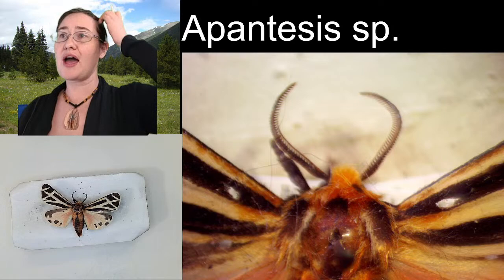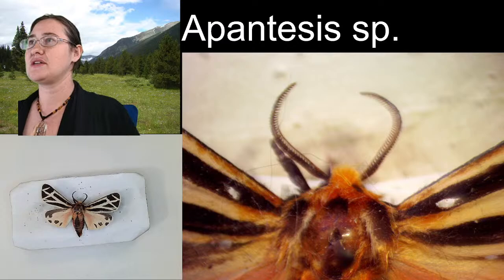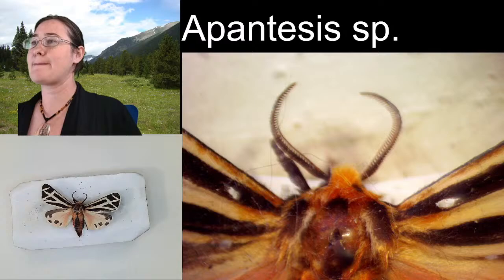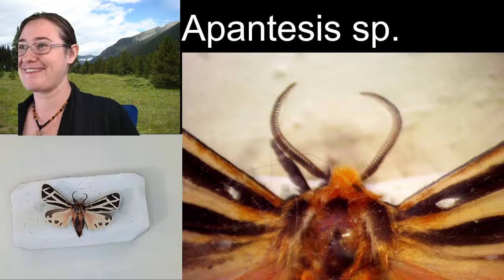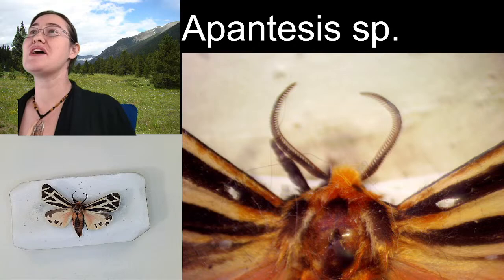All tiger moths... Let me make sure that the taxonomy hasn't changed. Because I was trained that all tiger moths are in the family Arctiidae. But, there we go. Okay. It has changed since I went to school. I thought so. Alright, so, let's go through a little bit of taxonomy while we're looking at it.